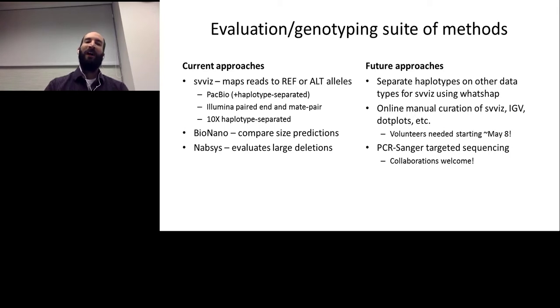And then we've also compared the sizes that BioNano predicts and that NABSys predicts to our calls to enable us to assess the accuracy of larger insertions and deletions.